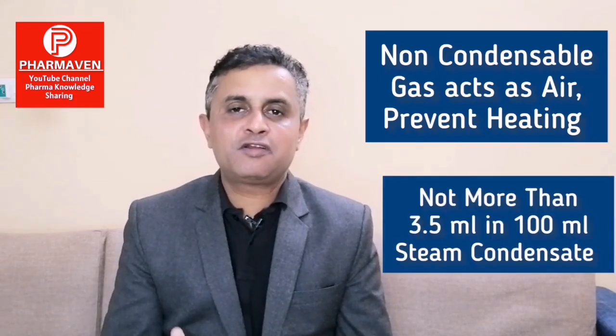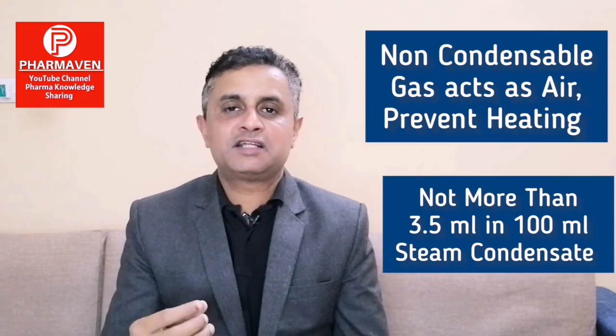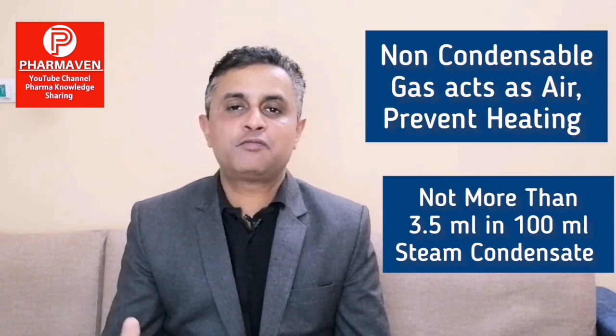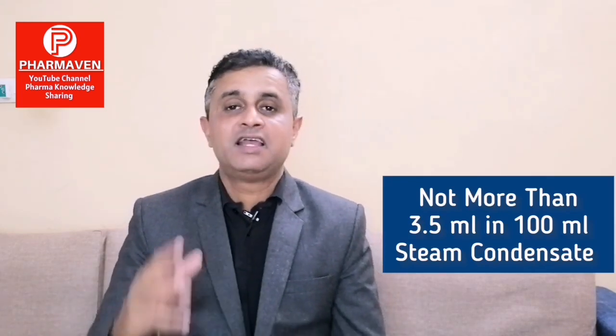So the non-condensable gases present in the steam are nothing but air, which will not condense to water. This air, acting as non-condensable gases, limits the ability of steam. So what is the acceptance criteria for the non-condensable gases? By testing, we condense 100 ml of steam to water. In that 100 ml of condensate, the amount of non-condensable gases should not exceed 3.5 ml. So per 100 ml of steam condensate, non-condensable gases should not be more than 3.5 ml. That is the acceptance criteria. And we understand that non-condensable gases are air, and they will prevent the steam from imparting effective sterilization.